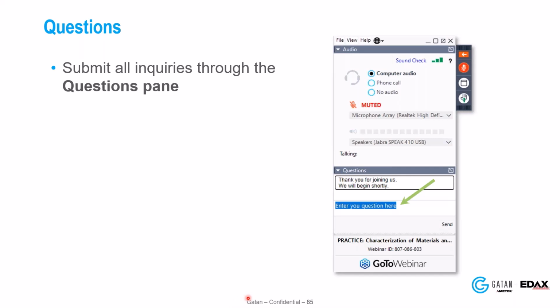The best way I'd look to assess that is to ask: do you have a pattern, first of all, that you can visually see, to check if the Hough detection is working? If you can't set up the system, slow down your acquisition, and get the best pattern possible, do you see a pattern at that point? If the answer is no, that's when I usually start looking at sample preparation. And the more you know about your sample, the more you fill in between these siloed answers.